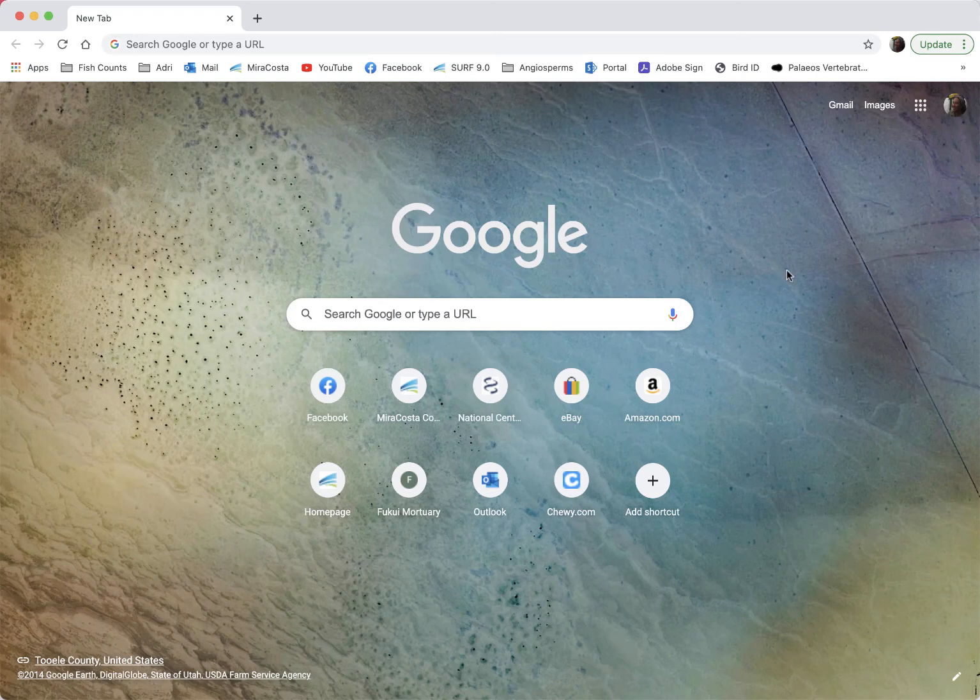All right, so let me go ahead and try to start this walkthrough of downloading sequences from the NCBI database and getting them into some format that we can upload into MEGA, and how to align and then run the sequences. There are going to be a lot of steps here. You can stop and rewind. I'll try to walk through and explain things as I go along.